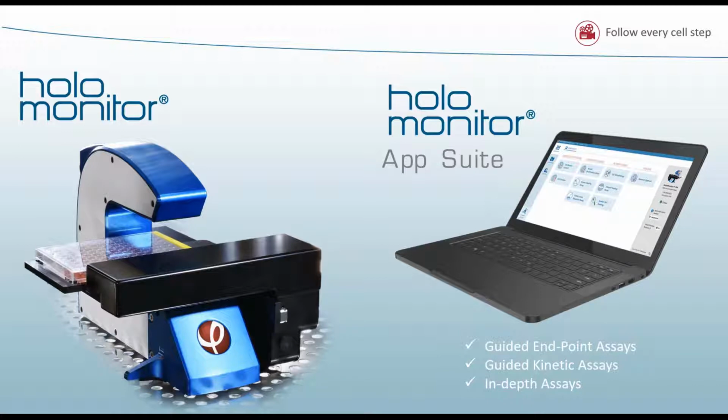So you just need to feed in cell name, treatment names, push the button, and the results will come up as graphs after the experiment has been run. There you can get a motility measure for how much your cells are moving.